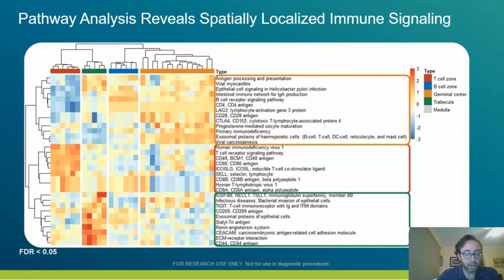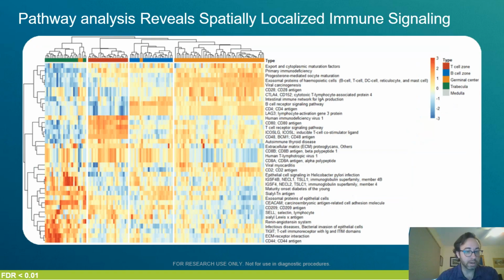One thing I noted at the onset was that we did this type of study across multiple different blocks. We actually purchased 5 different patient samples, and we're able to run this study across not just one sample, which is what's being shown here, where we're collecting 5 or 6 regions per particular structure. We also were able to do this across the entire cohort. And again, any of these types of analyses are robust to being able to look across cohorts. The benefit of this is that it allows you to feel confident that the results that you're getting aren't driven by a single given patient.